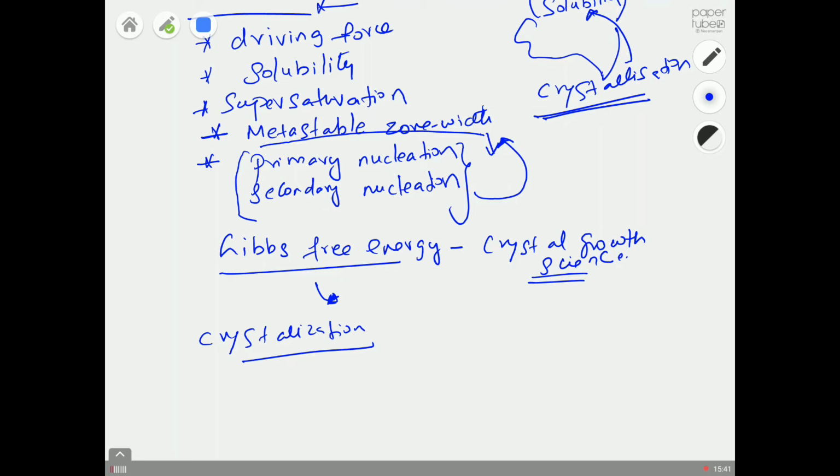Throughout this lecture, I'm going to draw some pictures. I'm going to ask you to imagine that's how the molecules look. They might come together, they may disappear again, they might form into something like a cloud, and then they might settle into some crystals and so on. You have to imagine all these things. That's the only way to understand the topic of crystallization, and that's the only way you will realize why crystallization is called a purification technique. But anyway, we will come back to that later.